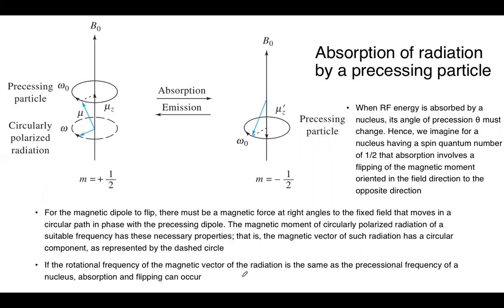So basically what this means is that there is going to be an energy difference between these two states. Instead of being described as the frequency of the gap, the energy gap is now based on the rotational frequency of the spinning of the nuclei. But the principle is the same. There is an energy difference, delta E, and that energy difference is equal to h nu, nu being the frequency, that frequency being the radio frequency energy which will be applied to the nuclei when they're in the magnetic field.